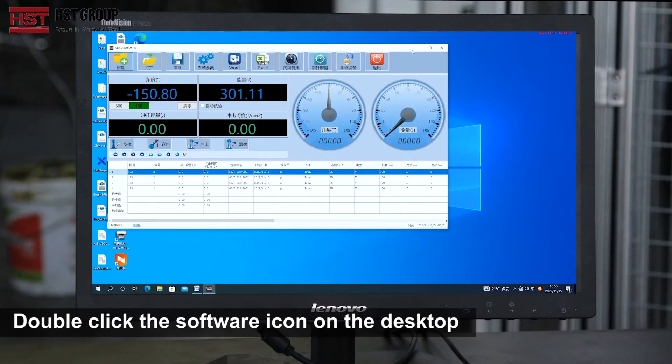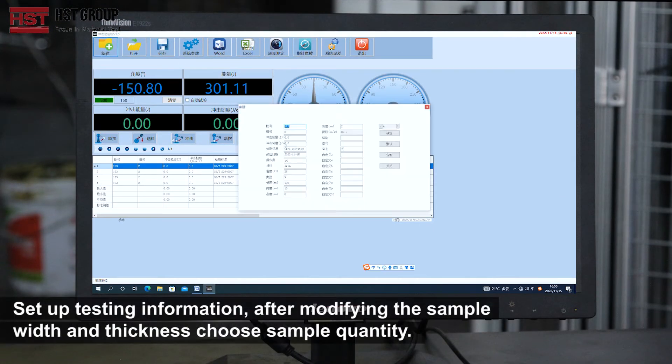Double-click the software icon on the desktop. Set up the test information. After modifying the sample width and thickness, choose the sample quantity.